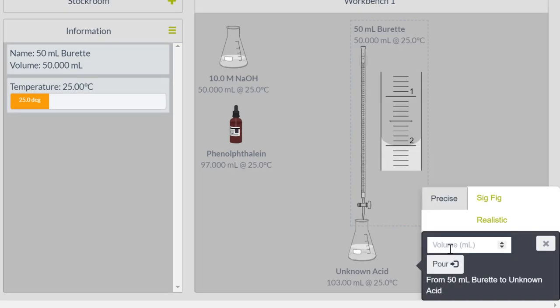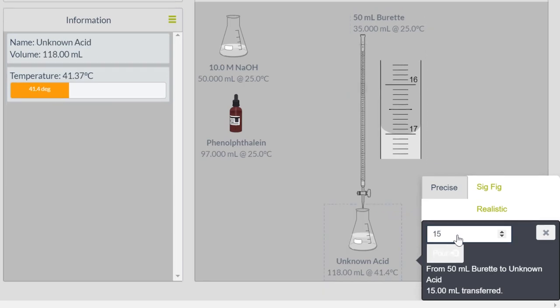I've already figured out kind of where my end point is. So I'm going to go somewhat quickly to that value. I'm going to put 15 milliliters in. You can see the volume of my 10.0 molar sodium hydroxide went from 50 down to 35, which means I've used 15 milliliters. I'm going to put four more milliliters really quickly in. And I'm going to put 0.5, half a milliliter in. Which means how much have we used? We've used 19.5 milliliters.